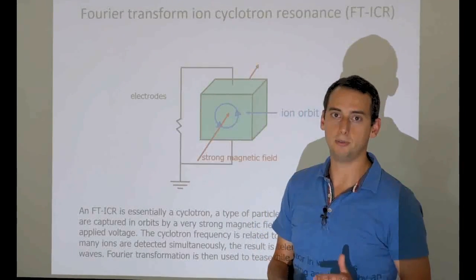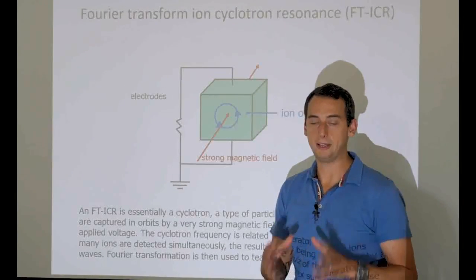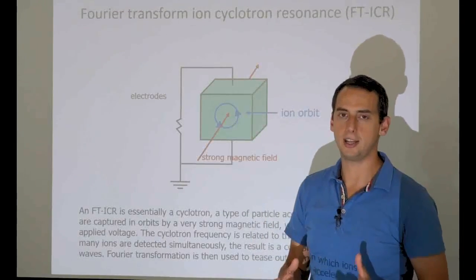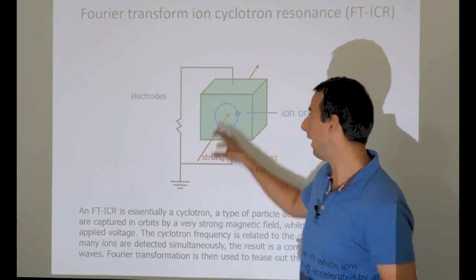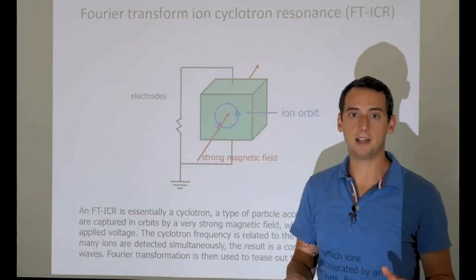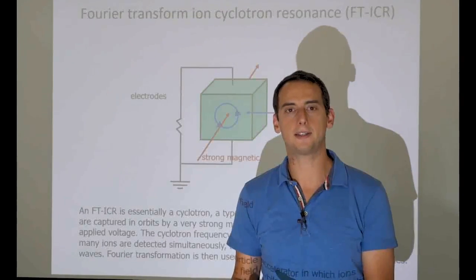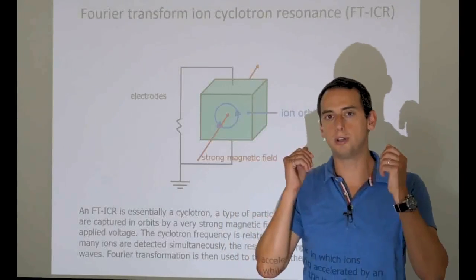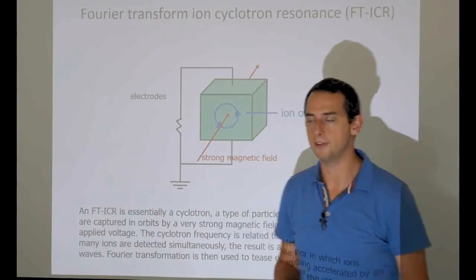Now, helium is a finite resource, it's quite expensive, and also this is very tricky, because in order to make liquid helium, which is very apt to escape if it evaporates, you need very sophisticated machinery, you need a lot of power. And then finally, the magnet generates such a strong magnetic field that nothing made out of any magnetic material like iron or steel is safe when it comes close to these magnets. It's the same as with NMR devices. So don't wear any steel rings or steel jewelry, because it will just tear off your body, and it will probably take some body parts with it.